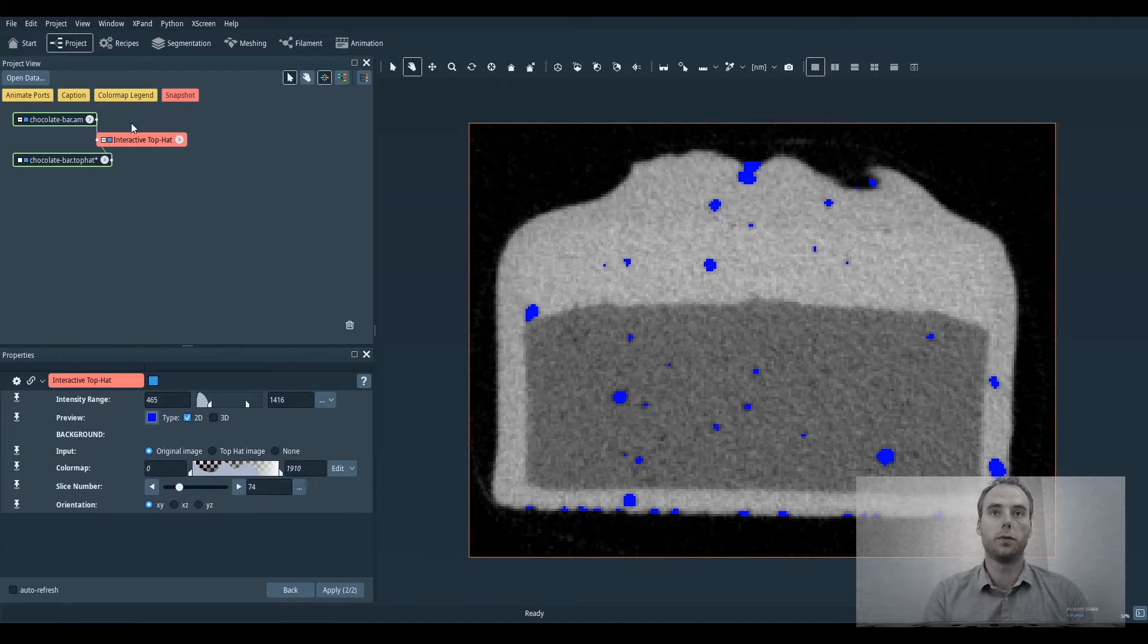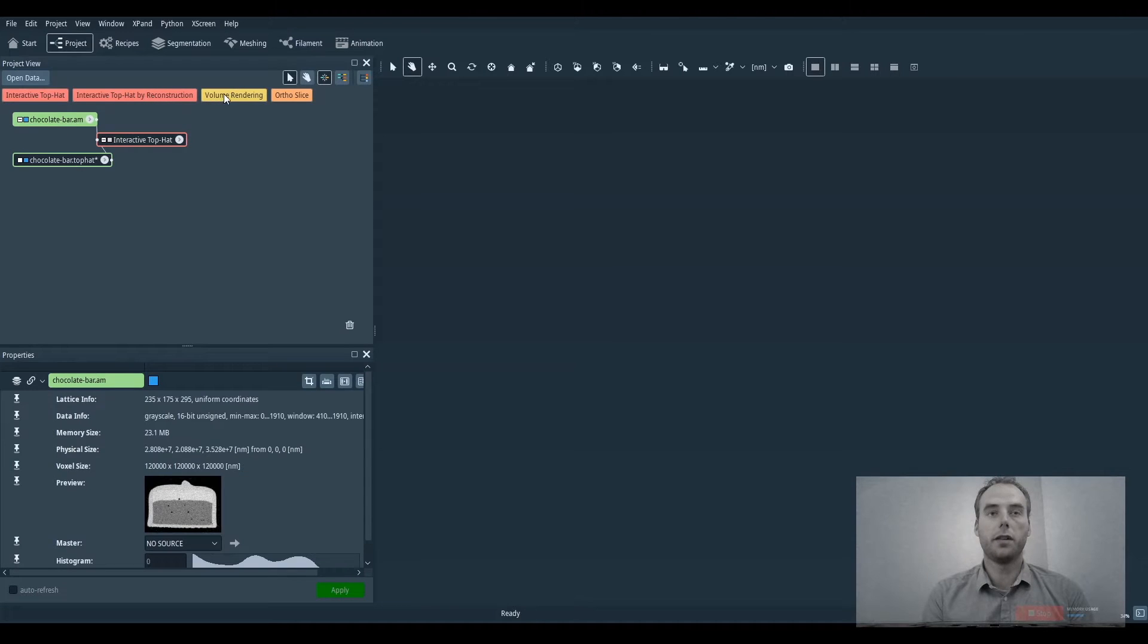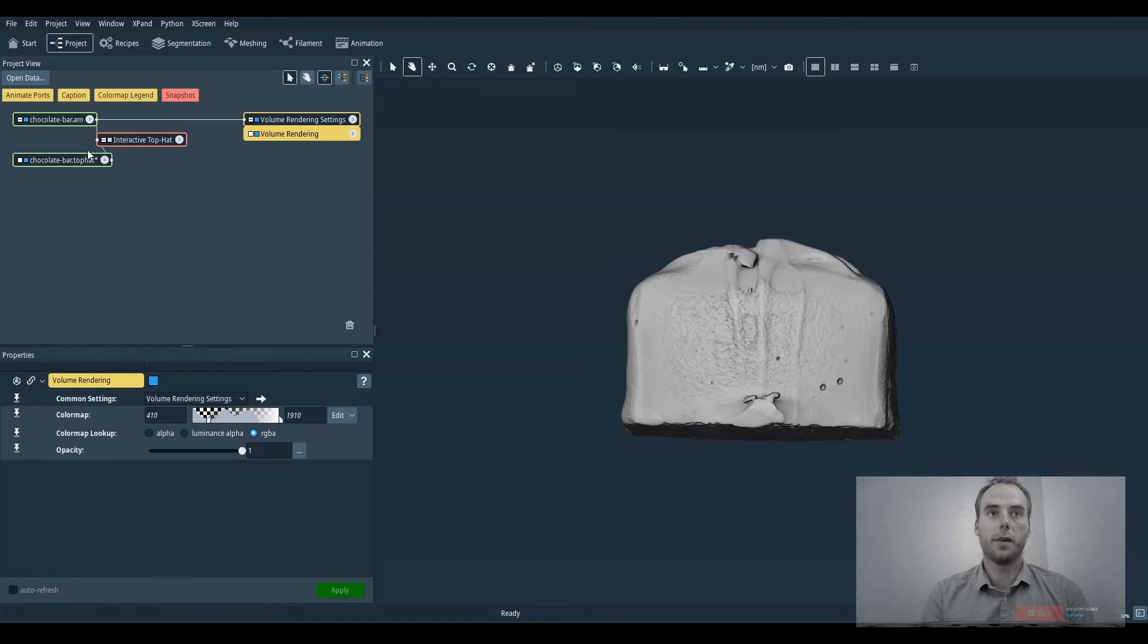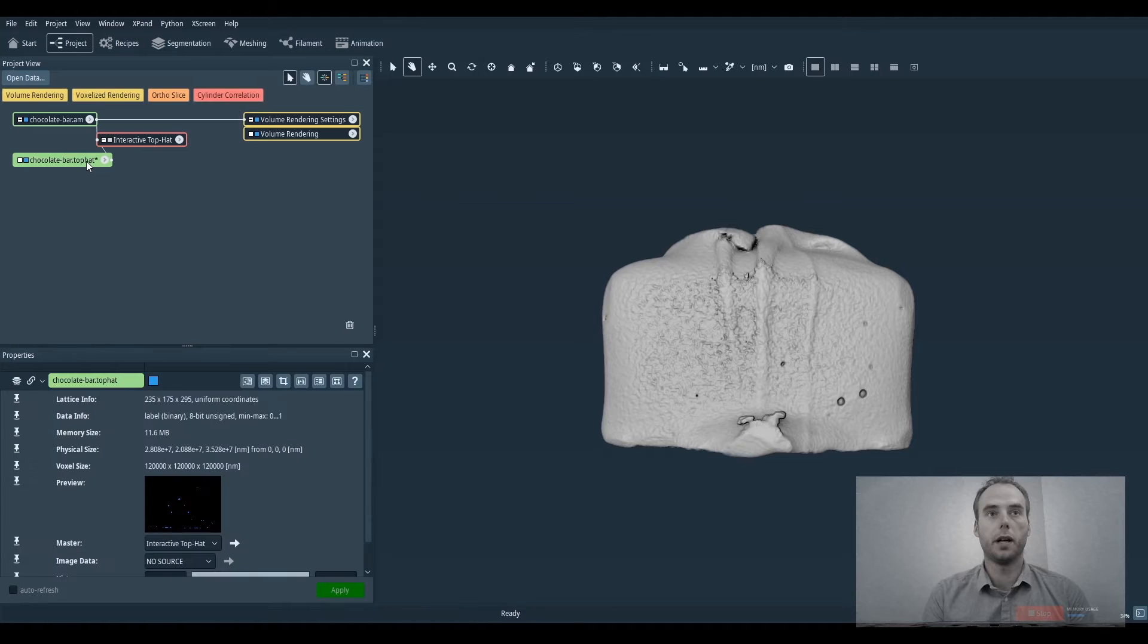It will generate the volume of the internal porosities. We can then visualize them with the original volume data of the chocolate bar.